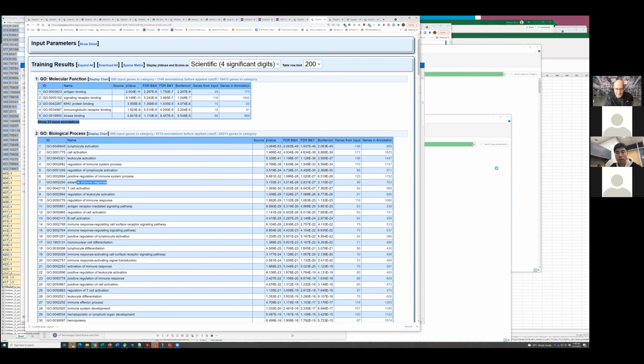We'd love to hear any questions or discussion, anything that could clarify what could make it a more likely event for you to get onto the tool and use it and try and extract useful information.